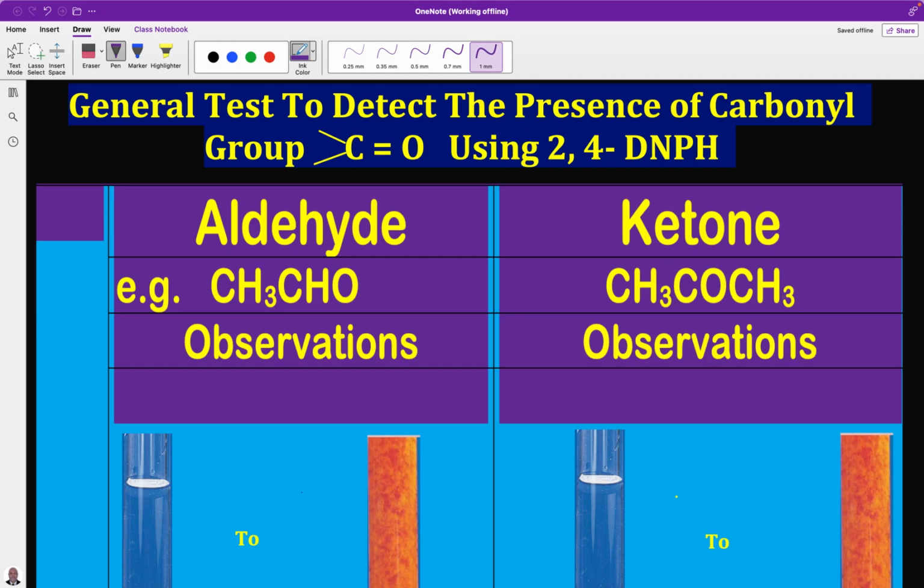In this video lesson, we are going to study the different identification tests that are used in identifying the different classes of the carbonyl compounds.